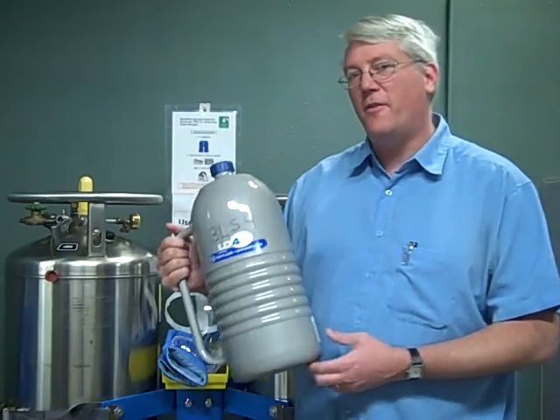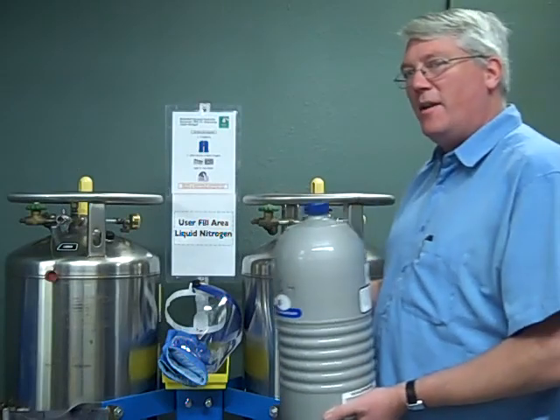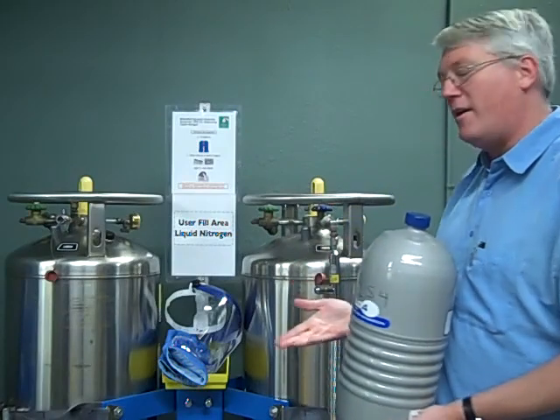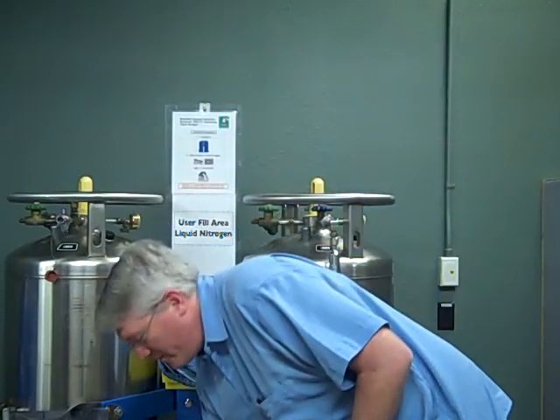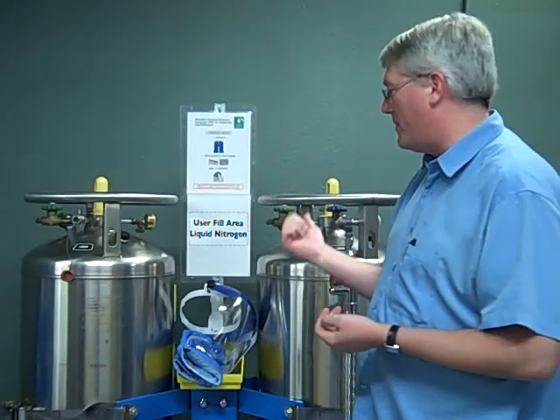This dewar needs to be filled from one of these larger dewars here. To be able to do that, we need to get the nitrogen into here using a transfer line. But before we can do any of that, we need to put on our personal safety equipment. What's needed for this procedure is gloves, safety glasses, and a face shield, because this is a pressurized dewar system that we're working with.